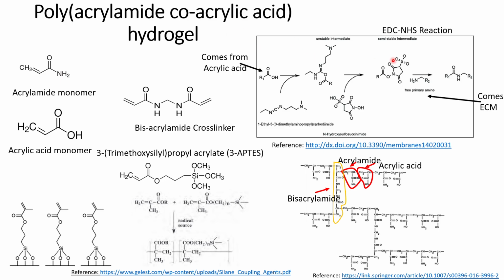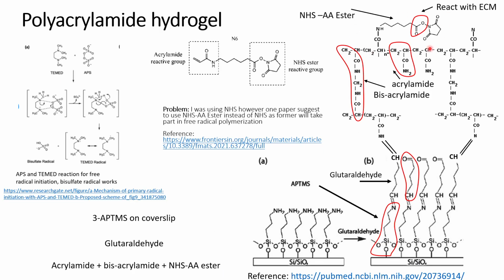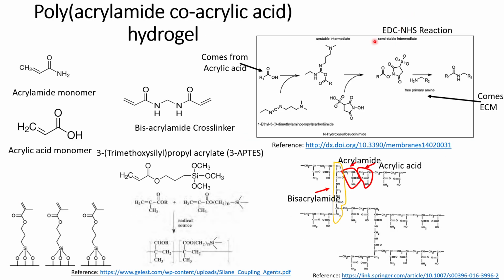The advantage here is that this intermediate is more stable compared to the NHS intermediate that we discussed in the previous video, which is stable for only 1 or 2 hours, whereas this is stable for a few hours if kept at the appropriate conditions, that is at low pH and at 4 degrees.